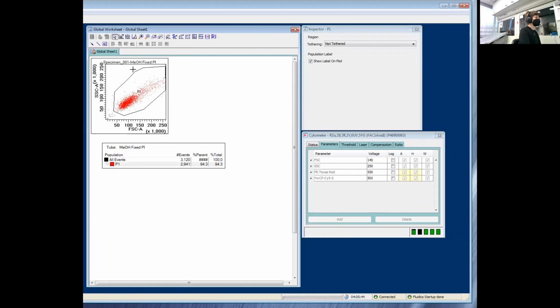Okay. I've shared this trick before, but if anyone's interested, if you hit the shift key on your keyboard and select a node, if you move slowly, you can make changes to the whole entire gate and you don't have to drag each individual node. Okay. It's just a nice little trick I like sharing because I didn't know about that one for a while.